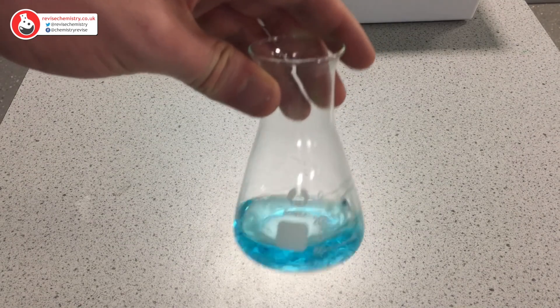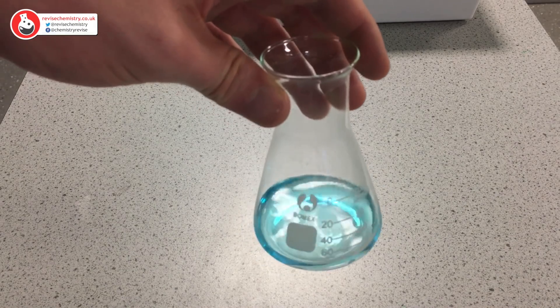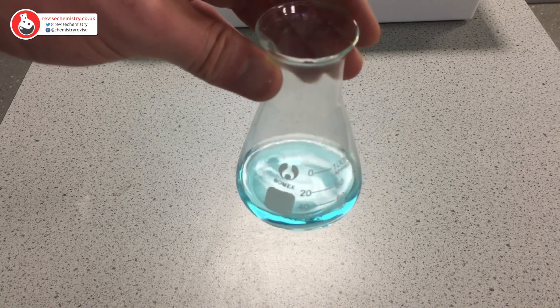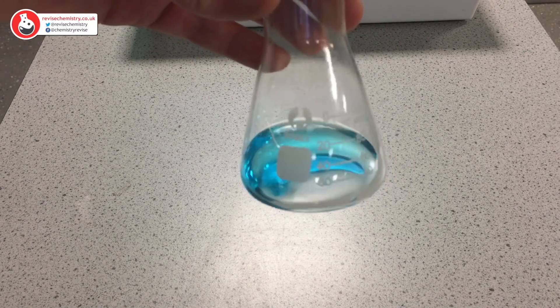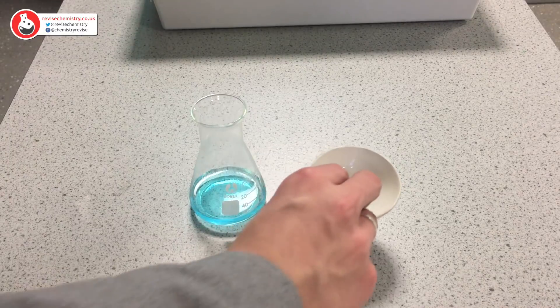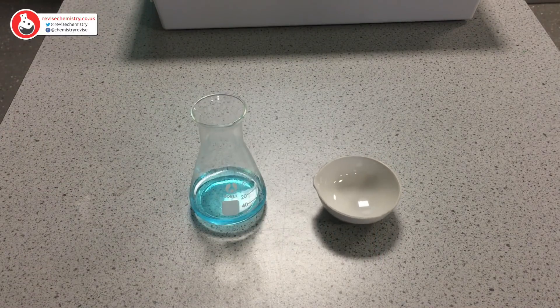This solution should now be copper sulphate dissolved in water, but we didn't want the water — we just want the copper sulphate. So we now need to remove the water. To do that we are going to need to use what is called an evaporating basin.